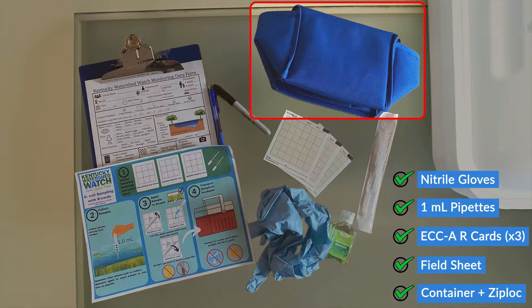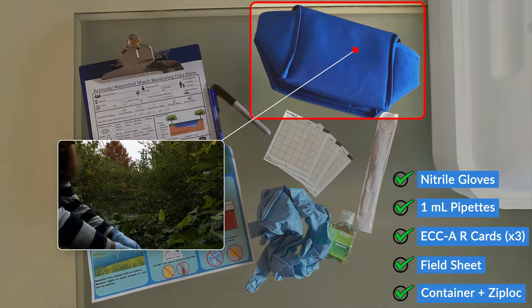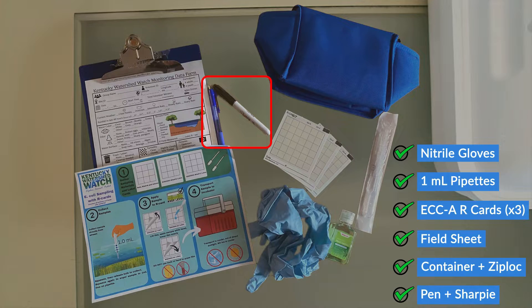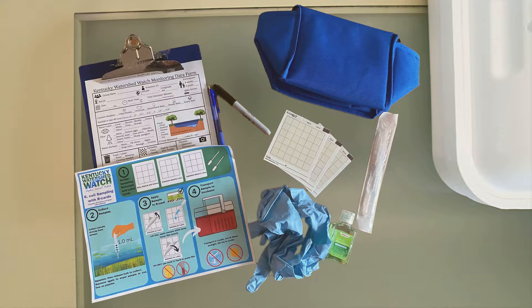Another item to include is a sealable container and a Ziploc bag to securely store the R-cards. The container serves as a sterile environment to store the cards before and after sampling and protects them from external contaminants and potential damage during transport. Also include something to write with, like a pen or Sharpie. Lastly, we advise that you bring a clipboard or a box, because the R-card procedure requires a flat, level surface for an even distribution of the sample between the top and bottom pieces of the card.